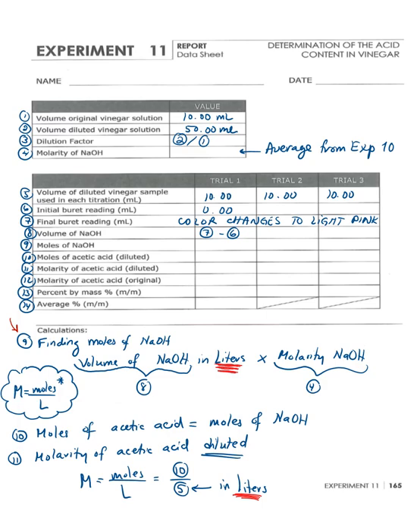So if molarity is moles per liter, it means that you know the volume and you have the concentration. Anytime that you have two out of the three variables in that equation, you can calculate the third one. If you know the volume of sodium hydroxide, which is the volume that you're calculating from your titration, the final volume in your burette minus the initial volume in your burette, that's telling you how much sodium hydroxide you're using for the titration. So you have that volume and you know the concentration of sodium hydroxide because you have that in your table right there for number 4.